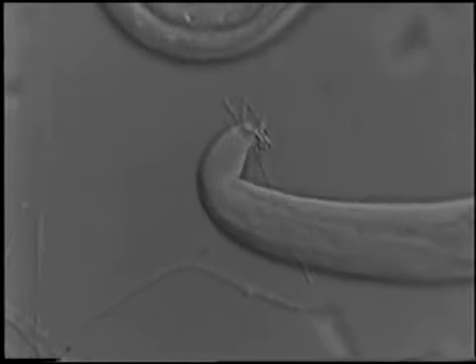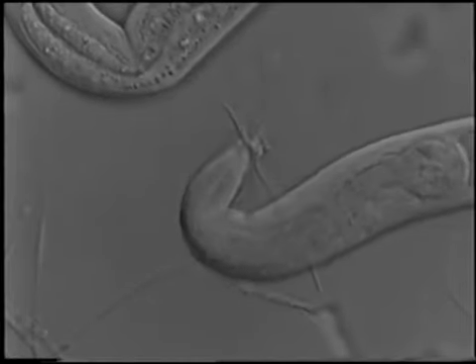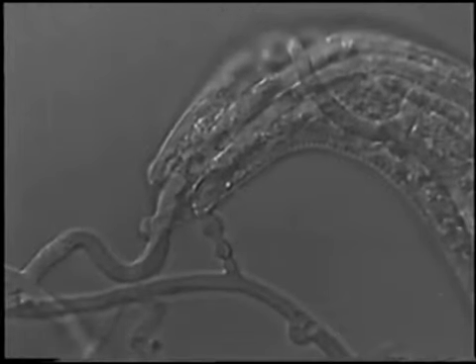The motility of the nematode decreases after the fungus has penetrated its cuticle. After some time, the nematode is completely filled with trophic hyphae. In the head region, lower right, the trap from which the lethal infection started can be seen.